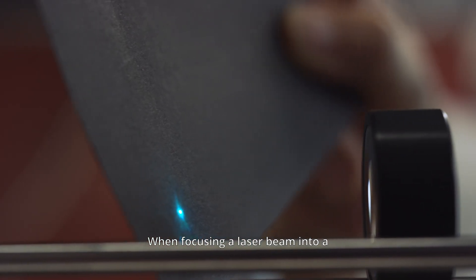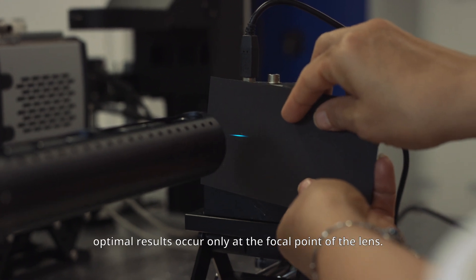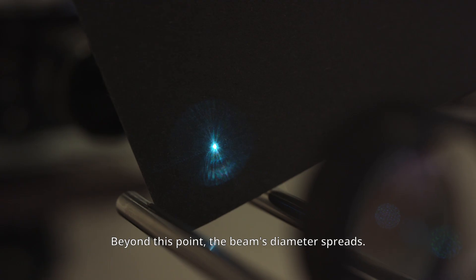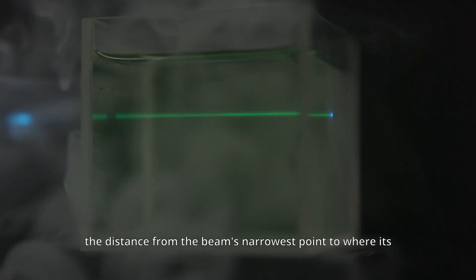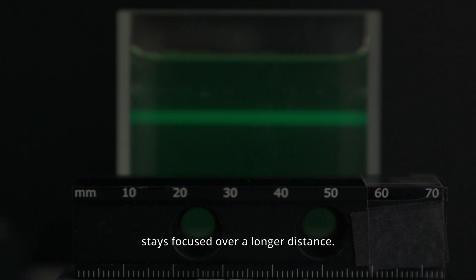When focusing a laser beam into a small spot using conventional lenses, optimal results occur only at the focal point of the lens. Beyond this point, the beam's diameter spreads. In laser science, this spreading is measured by the Rayleigh range, which is the distance from the beam's narrowest point to where its cross-sectional area doubles. A larger Rayleigh range means the beam stays focused over a longer distance.